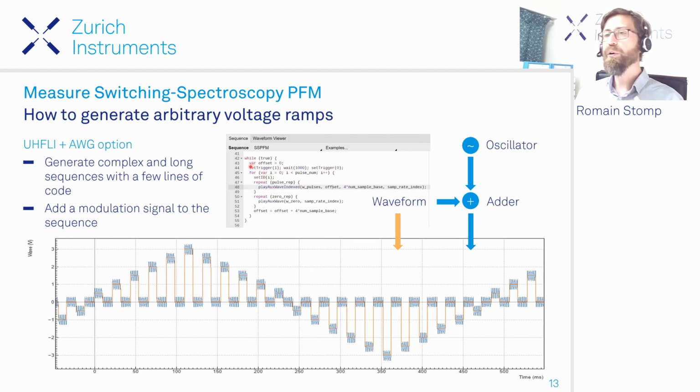So in this way, even if you want to make a long sequence where you need to repeat a lot, because typically for pump probe measurements, you often need to repeat the measurement a lot of times because otherwise the signal is too small.